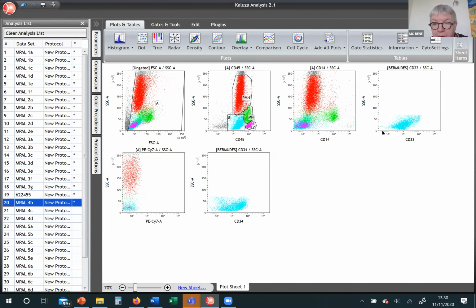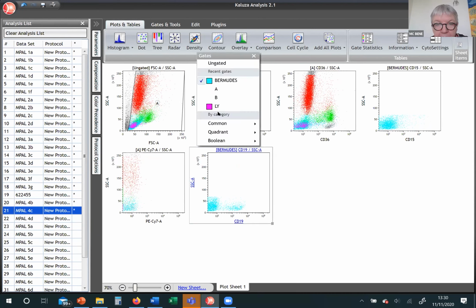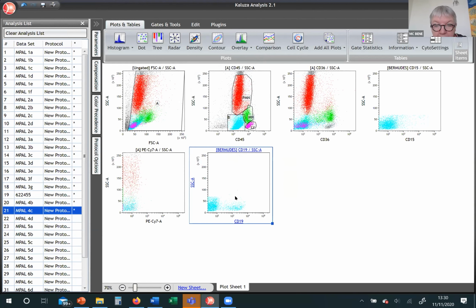It goes well because we now have CD33. You still see your monocytes in 14 and no staining on the blast. CD34, no surprise here. No 15, and we have a little bit of CD19, which is different from the normal B cells, because if I go again on my A gate, you see that there are very few B cells. Most of my lymphocytes are T cells, and clearly this is a subpopulation of the blast population that is expressing 19, but very a minority of the cells.